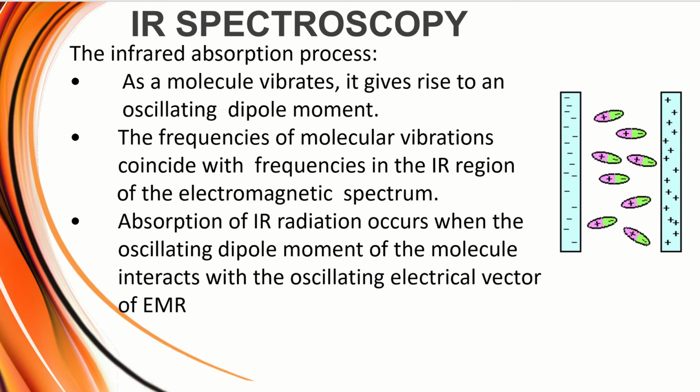Well, a molecule that is polar would have different atoms of varying electronegativities, right? So we'd call this molecule polar. And in the presence of an electrical field, it will turn to align, right? Much like the image that we have here to the right of our screen.